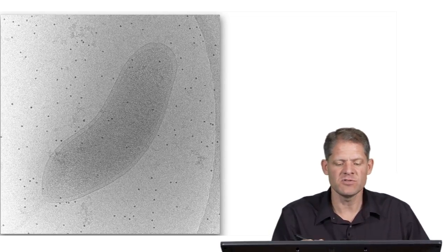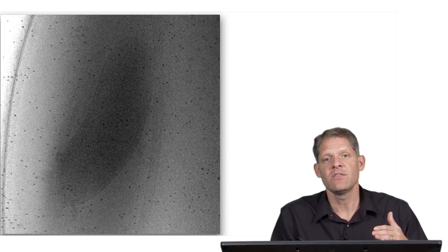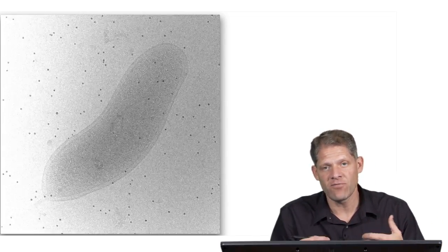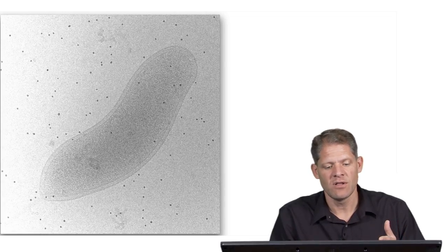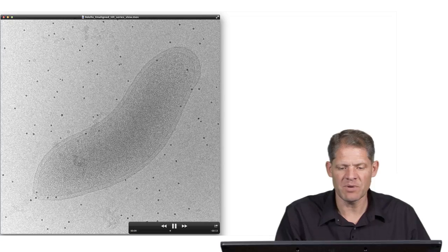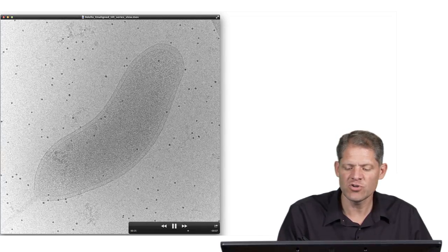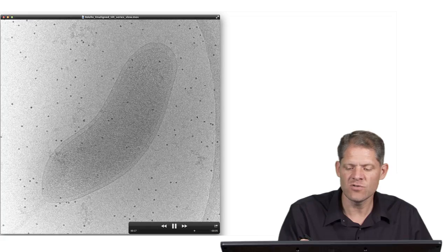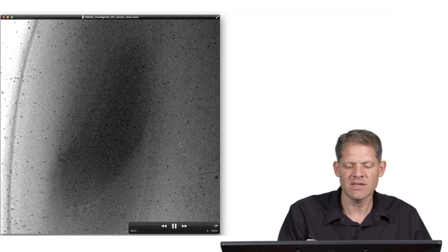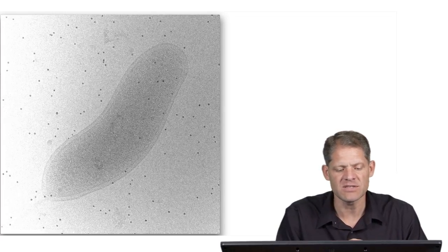This was recorded using the predictive method. And as it predicted the X and Y shifts that would be occurring for each new image, there are small errors in that. And so that's why you see it jumping around. For this reason, we add these gold fiducial beads into the sample. And they're frozen in the ice, and so we can track the shifts using those fiducial beads.